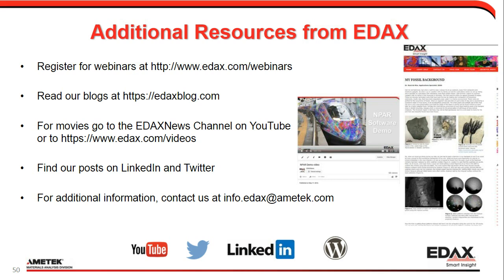The next question is: what will happen to TEAM software? It is going to be stopped because Apex has all of the TEAM capability. Right now, Apex is an advanced package. Most of the features in TEAM are available in Apex.